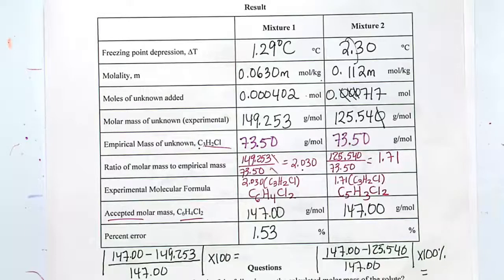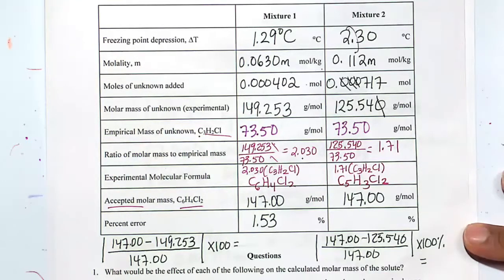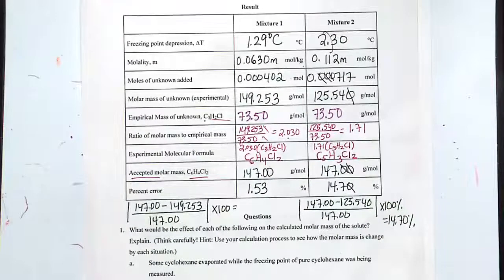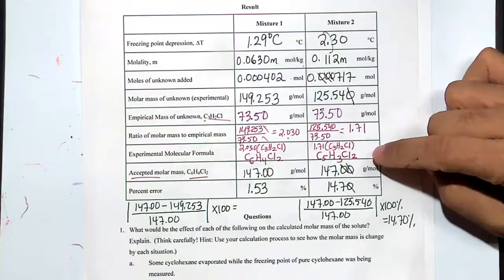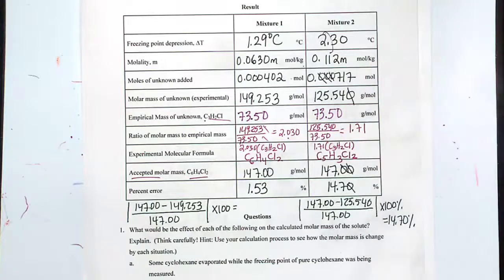Some scientists don't do that. It's perfectly legitimate if you do it either way. And doing that, we're getting about 14.69, 14.70% error. The second mixture, when we added the additional 0.03, we got a kind of a big error. Also, our empirical formula really didn't match the formula that they told us in post-lab question number 6.